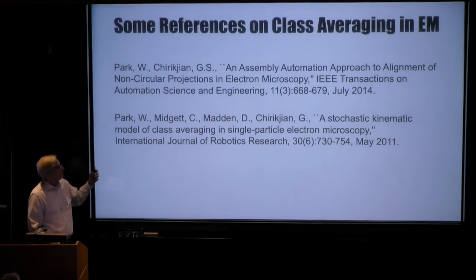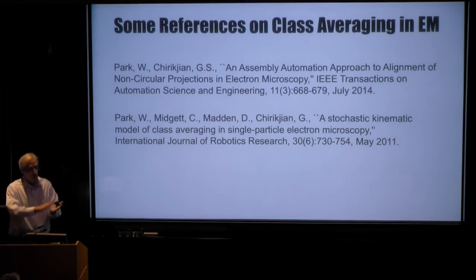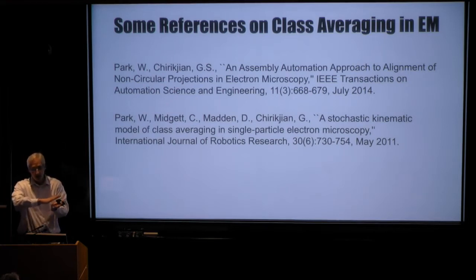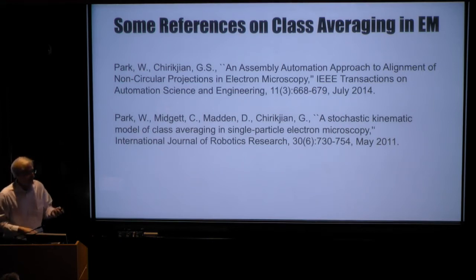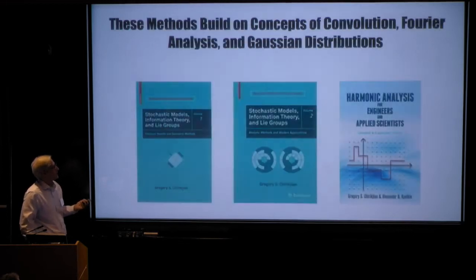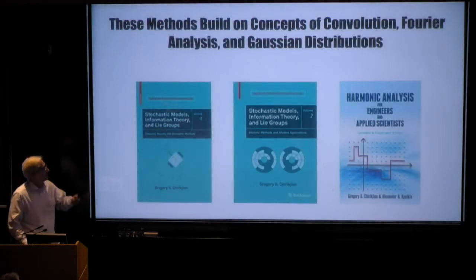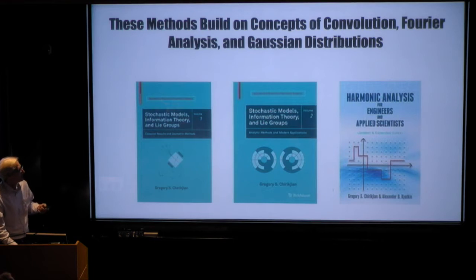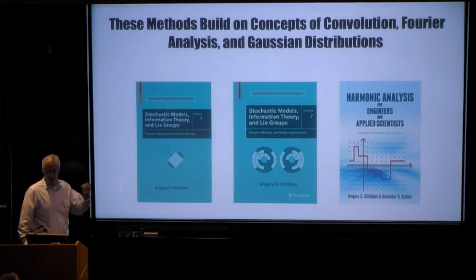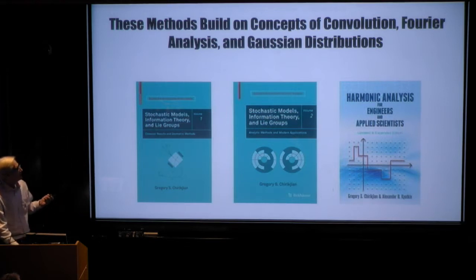So we developed some methodologies modeling this motion blurring as a convolution over the group of rigid body motions of the plane, and developed what kernel could be used to describe that blurring process, and developed a deblurring process by a deconvolution involving these methods. And these methods are built on work in my books. I'm actually not from this field. I'm from the field of robotics, but dabble in other things as well. And the connecting methodology between the various fields that I work in is this underlying math.